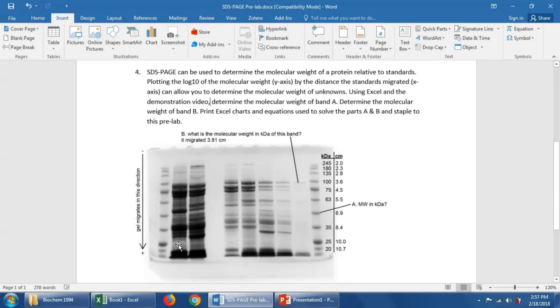Samples were loaded here at the top and they migrated down through the gel toward the positive electrode. On both edges of the gel, standards of known molecular weight were loaded, shown here.